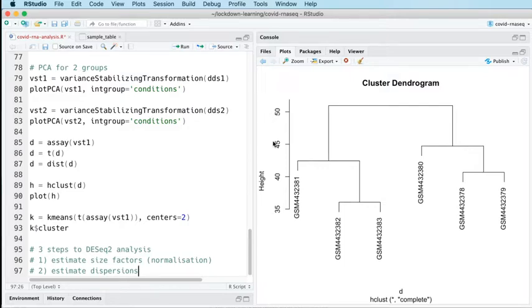An RNA-Seq experiment is costly, both in terms of the time it takes to prepare and sequence the samples, and also in purely monetary terms. So you don't sample as many individuals, but we are measuring many, many more variables. And we can take advantage of that in an RNA-Seq experiment. So instead of measuring 1 or 2 variables, we've measured 60,000 variables because we've measured the expression of 60,000 genes. And there are relationships between the expression of those genes. They are not entirely independent measurements.